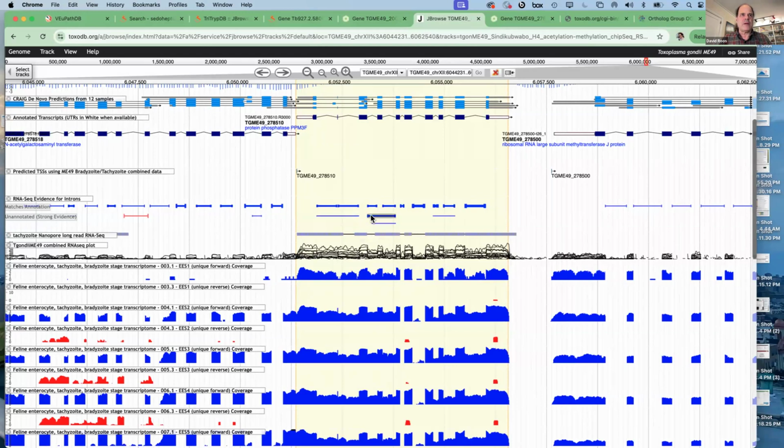But let's move downstream, and we can see that if we look at introns 3 and 4 spanning exon 4, while intron 3 is excised 8,600 times and intron 4 9,500 times, there is roughly an equal amount of experimental support for skipping this fourth exon. So here, the frequency with which this exon is skipped is roughly the same as the frequency with which this exon is included.